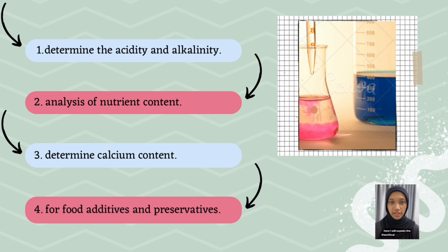Here, I will explain the theoretical application of volumetric analysis in the food industry. This method is widely used to determine the concentration of analyte in a solution. Firstly, determination of acidity and alkalinity. Those will affect taste, preservation, and microbial stability.